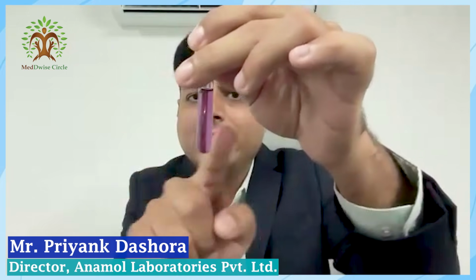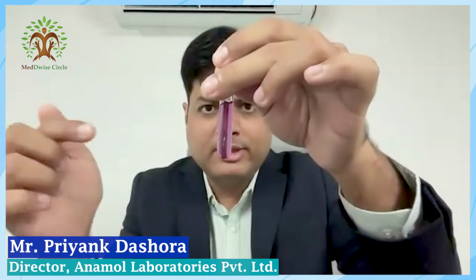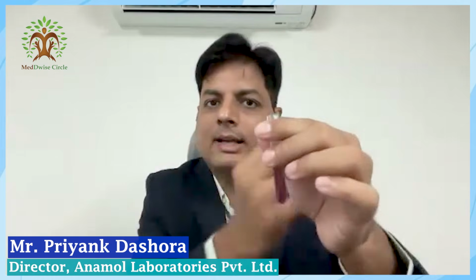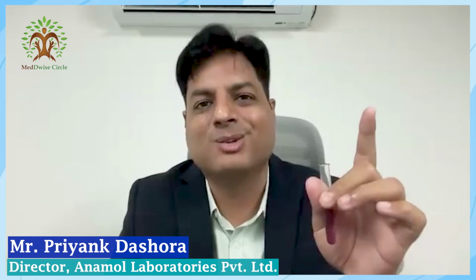So the length of the test tube through which the light is in contact with the solution is called the path length. If the distance between the entry point and the exit point is very large, that means the light is in contact with the solution for a longer period of time. Therefore, the solution will absorb more light.